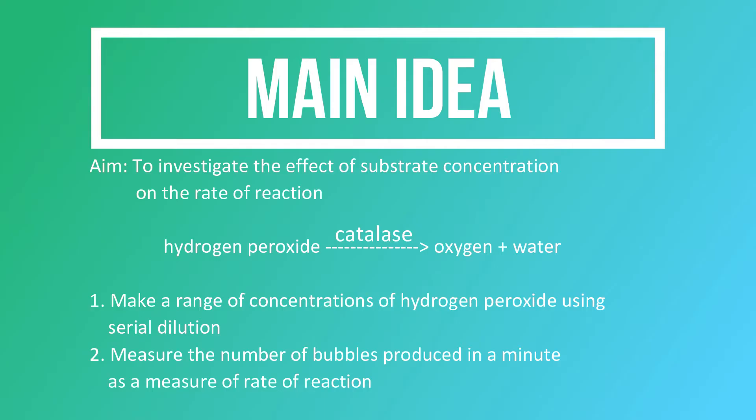The first thing we're going to do is to make a range of concentrations of hydrogen peroxide, which is the substrate, using serial dilution. And then we are going to measure the rate of reaction by measuring the number of bubbles produced in a minute. Bubbles are produced in this reaction because oxygen gas is being formed.